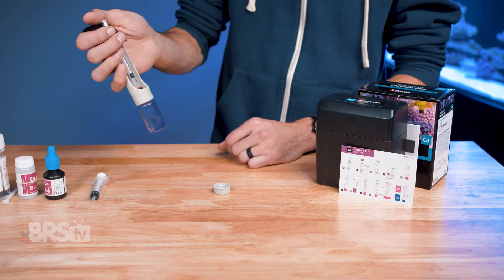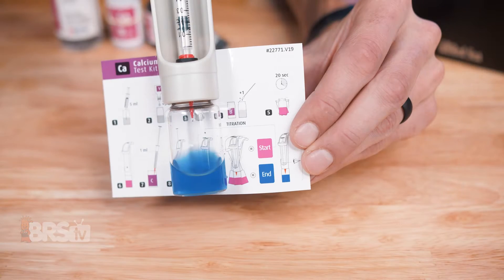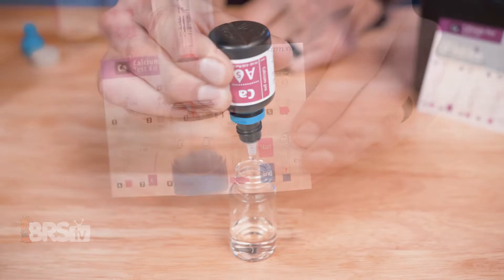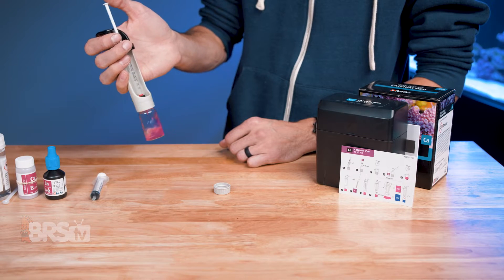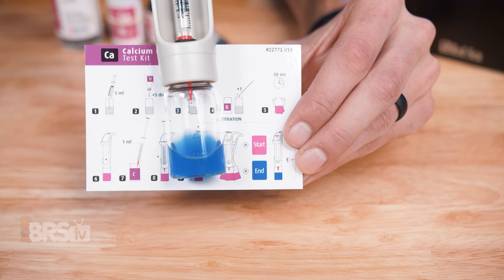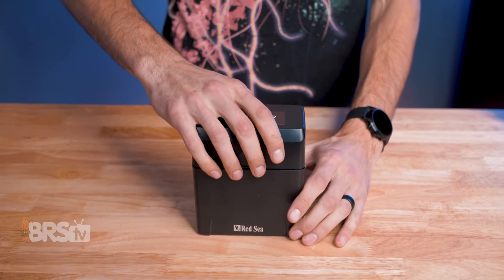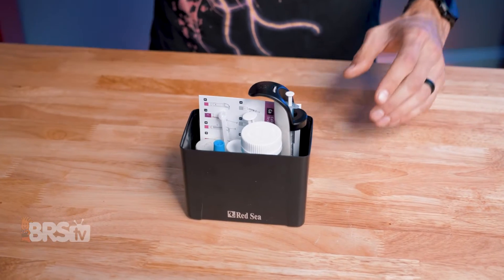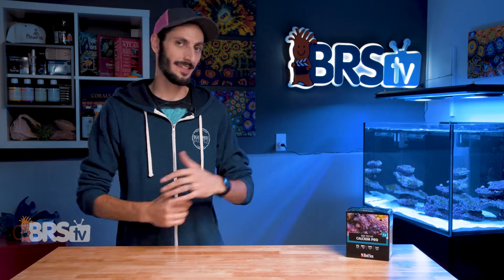If you want a quality test kit to keep tabs on the calcium level of your tank with an easy-to-follow visual instruction card, premium dropper bottle, glass cuvettes, and a titrator that makes the test itself a breeze to perform consistently with a very simple and easy-to-read endpoint color, all stored in a hard case to keep that test kit and its components neatly packed and safe from splashes, then check out Red Sea's Calcium Pro Test Kit.